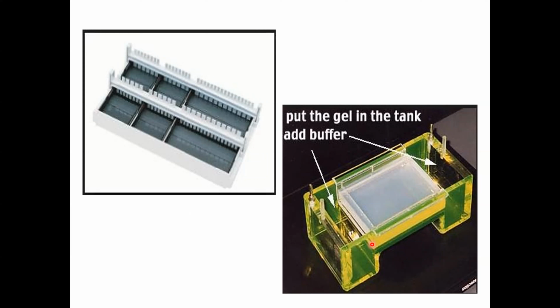Gently remove the comb. After that, you put the gel in the buffer in the gel electrophoresis box. Carefully, you can then start adding the first lane of your tracking dye. As I mentioned, you have to be careful. When performing a gel electrophoresis, you have to avoid direct contact with the reagents, because some of the reagents used in gel electrophoresis are very cancerous.